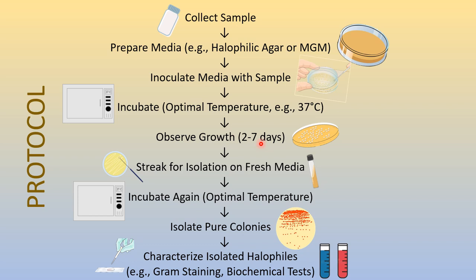So it may happen that some microbes need time to adapt and grow. So never report your results in 2 days. At least try to wait for 5 days, and observe if there are any new colonies or any other observation that you can report.